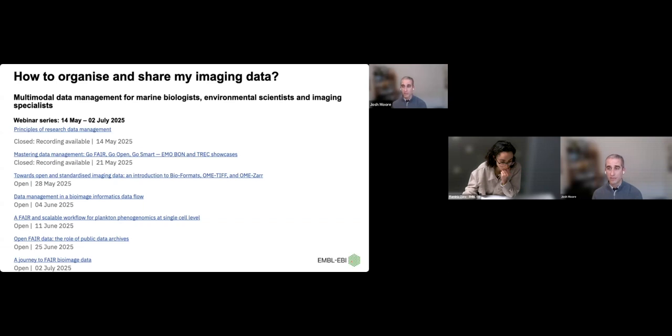What that might look like, for example, is just telling Omero, okay, there's some data over there in S3, and you don't even actually have to transmit it to Omero. That's being used currently at a number of pharmaceutical companies. And if you're interested in trying that out, please get in touch.